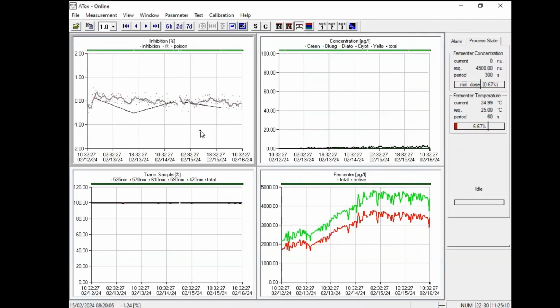I only can say that the consumption of 50 liters a day, more or less, is a figure you have to think about. It's depending on the pump times. If you have longer pump times for filling the loops to reduce the noise, it means also you have more water consumption.